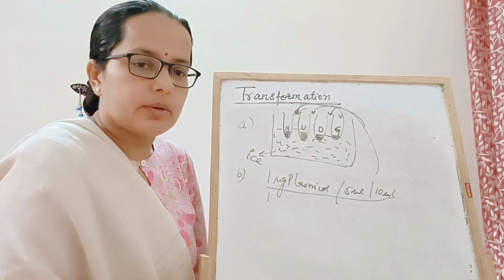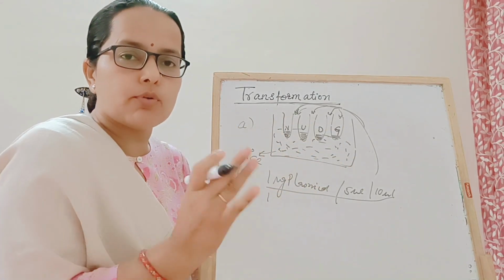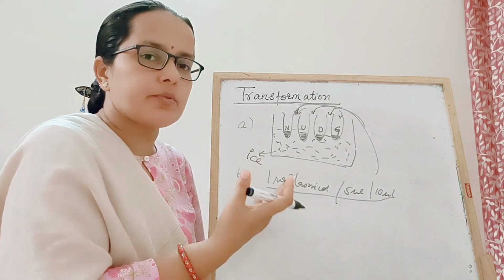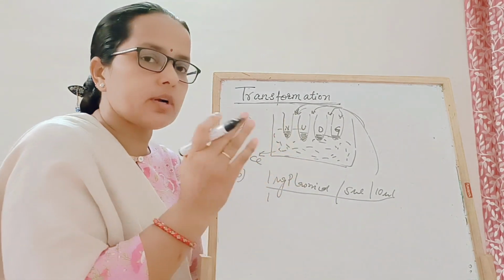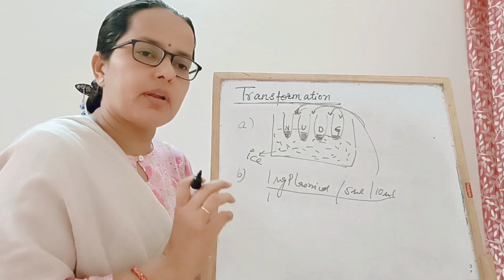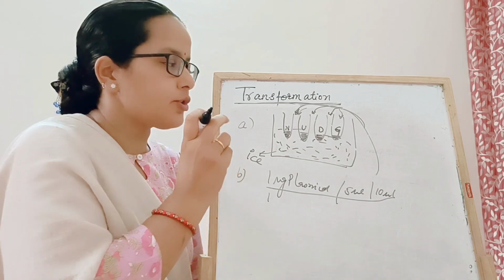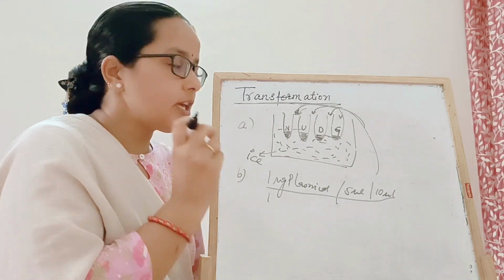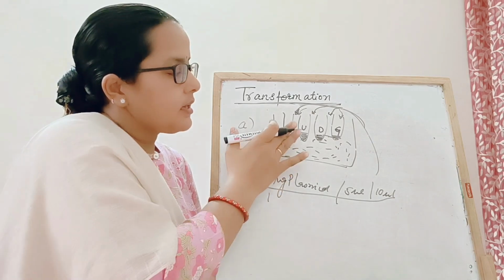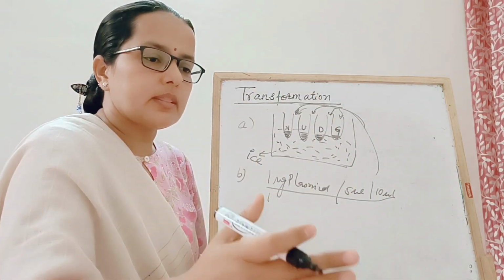One very important thing to remember: label all four tubes before you start your transformation, otherwise it will create confusion at the end. Seal the label with transparent sellotape so that you can recognize each vial, because you are placing your vials on ice and in the water bath.